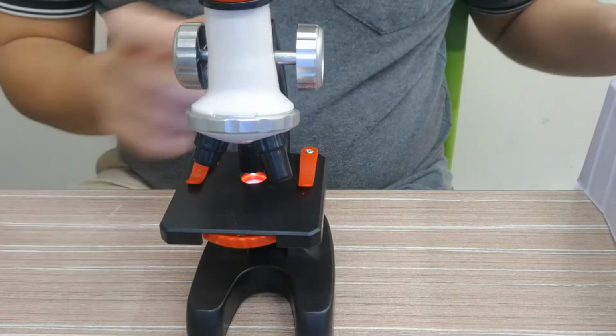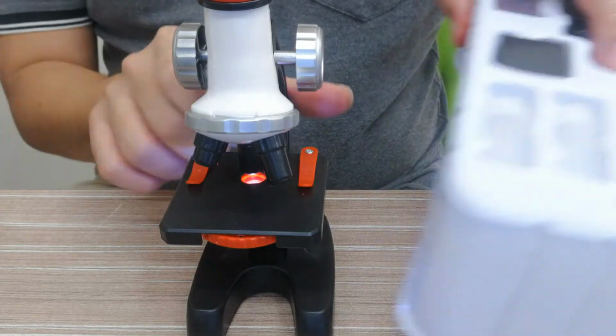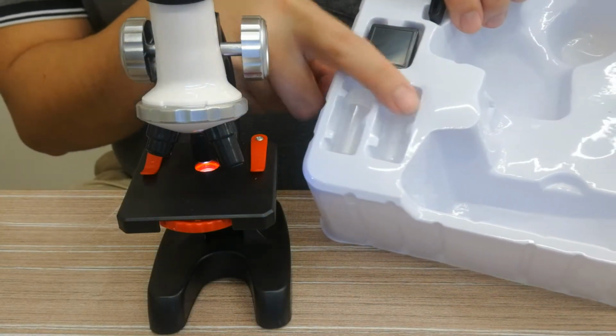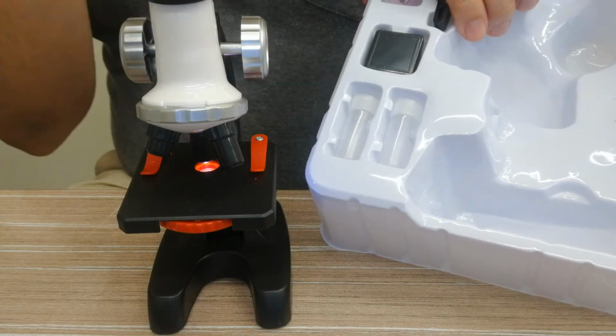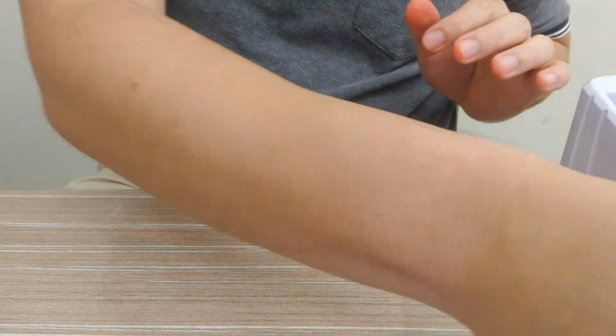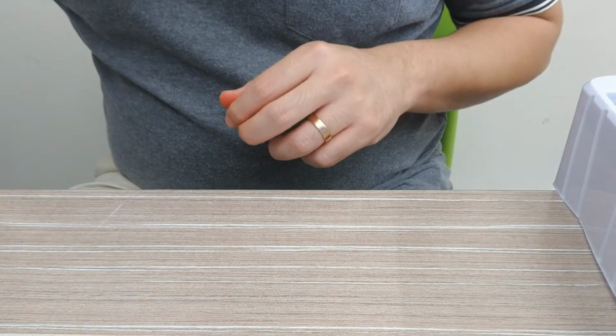Inside a box, there's a forceps, and there is this container for you to put in a specimen. Maybe you can put the pollen inside during week 4 of the experiment. So without further ado, I will teach all of you how to take out the onion skin.